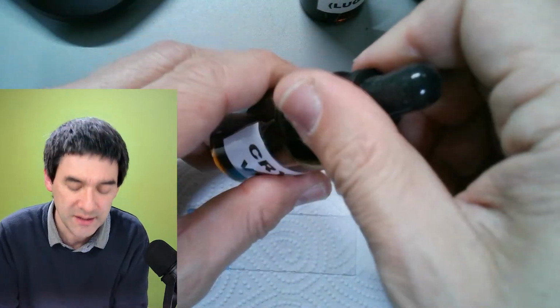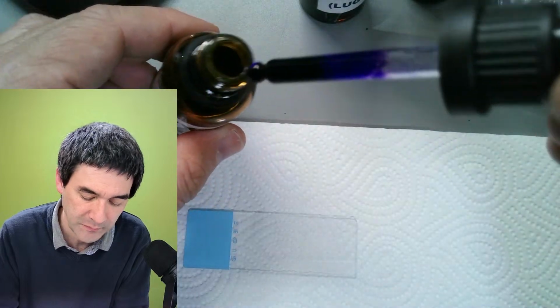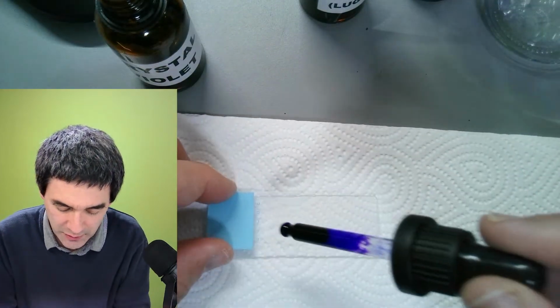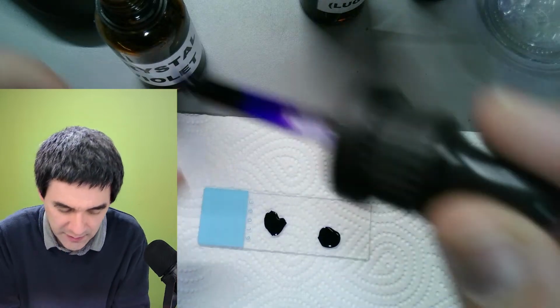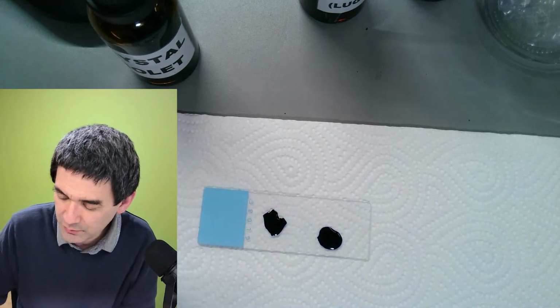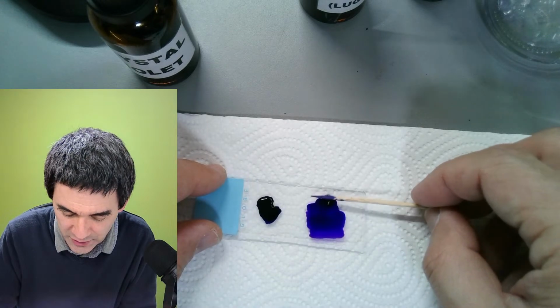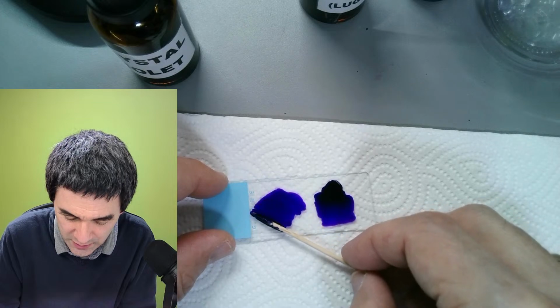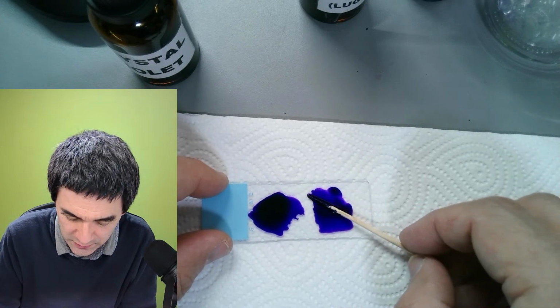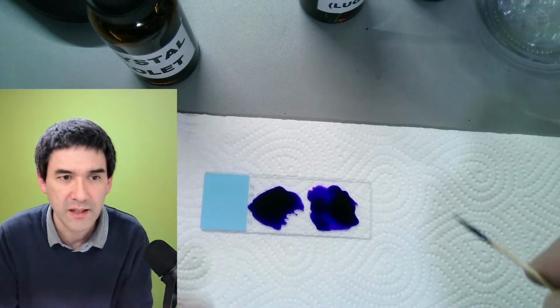Okay, so this is a very strong stain. And I'm going to put it directly over here. I have to see where is the here and over here. And now I've got these toothpicks here, because I'm just going to use those toothpicks to spread it carefully, without touching it, over them, so that all of them essentially are carefully covered. Okay? So that's basically, yeah, step number one.